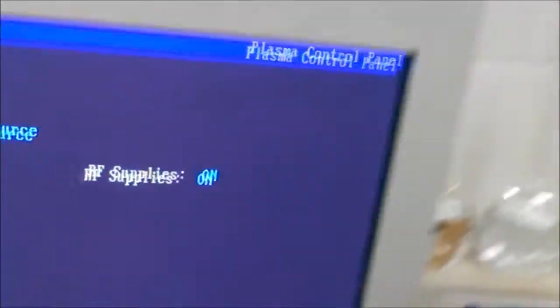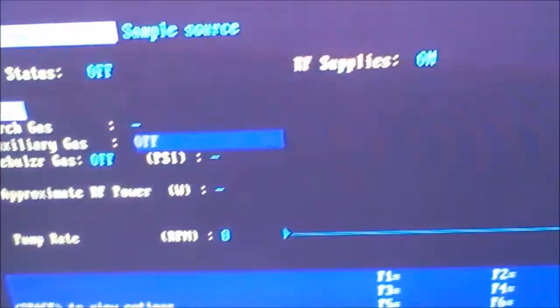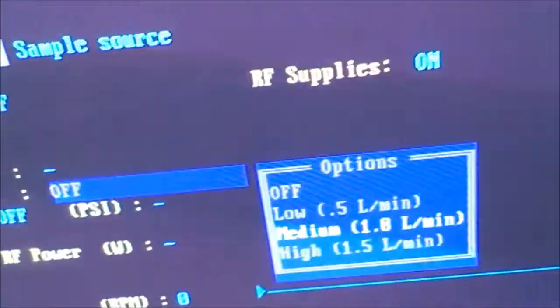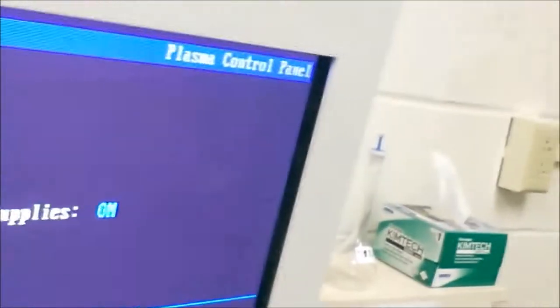Let's go over to the computer. We see this screen here — it's a little confusing, but basically what we're going to do is go to Levels. You see that this comes up. We're going to go to auxiliary gas, press space, go down to medium, press enter, turn it on. Nebulizer gas on. PSI is automatic — it'll come in at 22.4. You can set it up to 30; a lot of times I set it to 30 in my methods. Then we turn on the pump. The pump will pump at 100 RPM to start — that's a good place to start. Then we press done to keep everything. Now we've set up all of this running — we have a nice peristaltic pump set up and we're having good flow in the nebulizer tube.